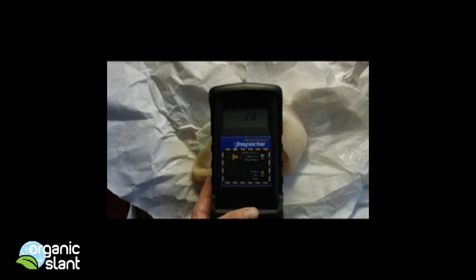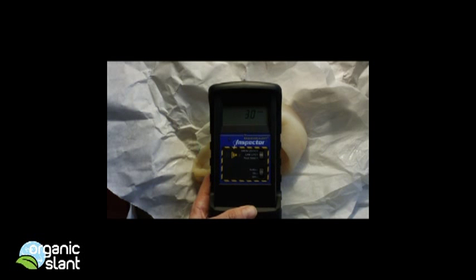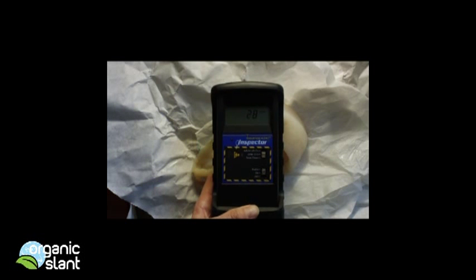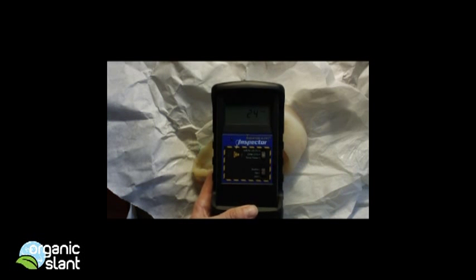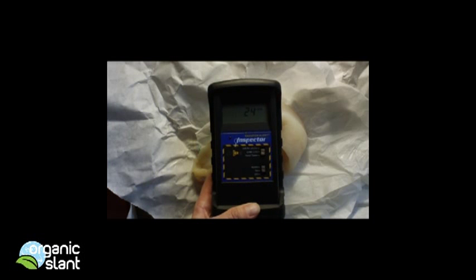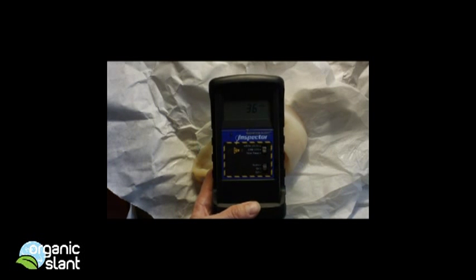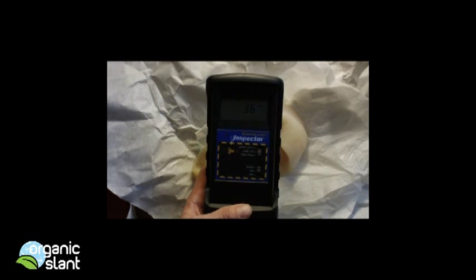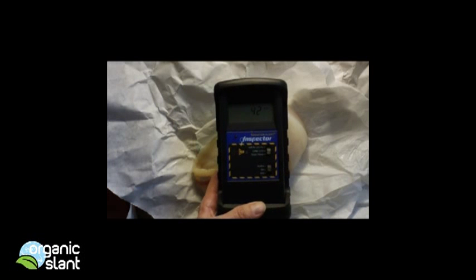Now this is the fresh, not frozen and thawed, wild cod. Bought today, February 2nd. No, today is February 9th, I'm sorry. 2012.